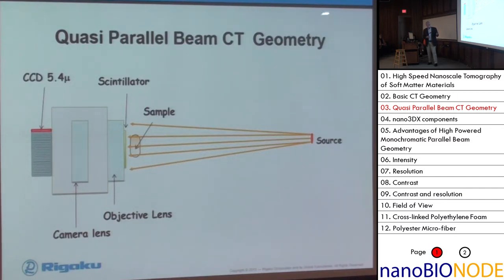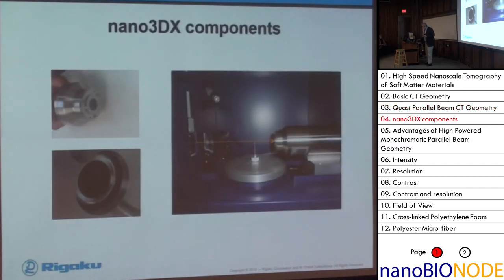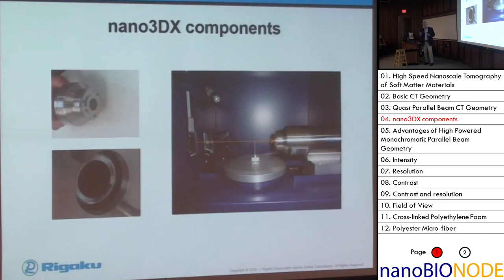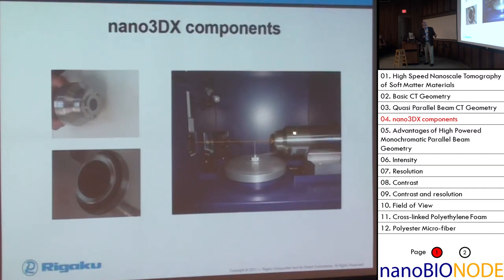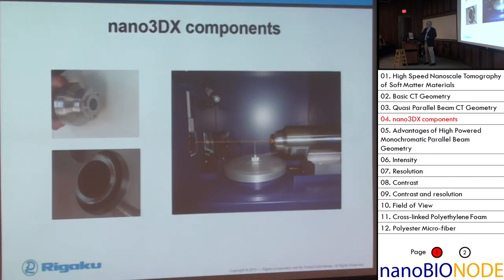When we use this quasi-parallel beam geometry system, we have a couple of things that make it ideal for looking at soft materials. I only have 20 minutes, so I'm going to go through slides pretty quickly. This is an actual photo of the inside of the machine. Here's the x-ray source, here's the x-ray detector where you're looking at the scintillator, then there's a lens, the camera lens, and the CCD is sitting off on the wall. Here's the sample, which sits on a phi axis that rotates the sample 360 degrees - that's how we rotate the tree.